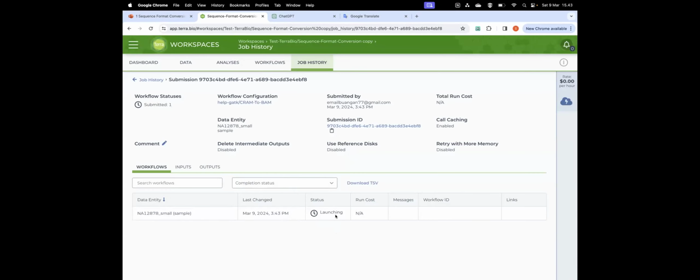Okay, the status is launching. We can wait until it succeeds. Okay, while we wait for this process, we can go to the next step.